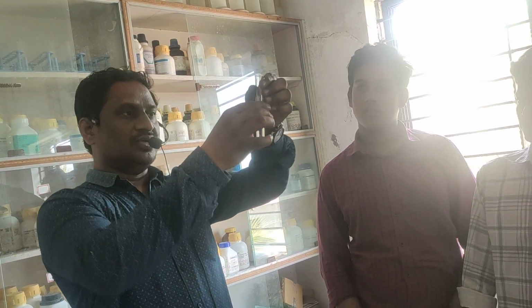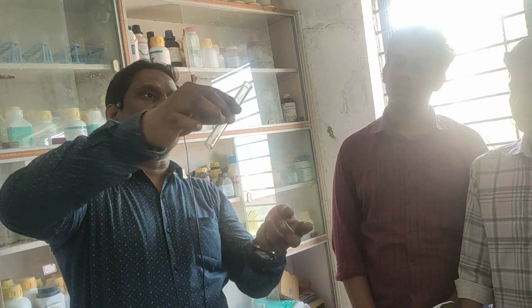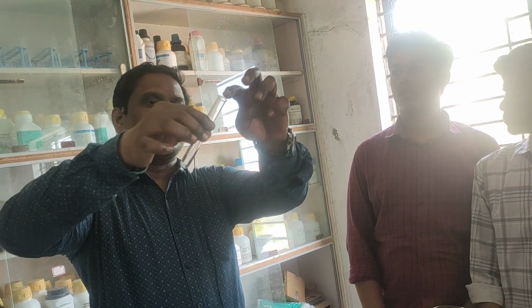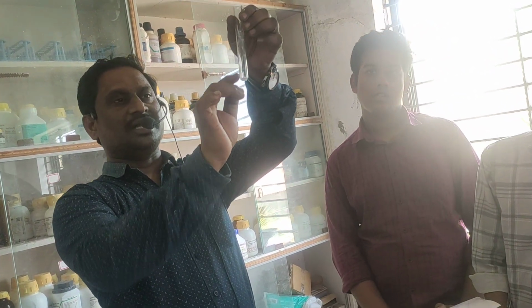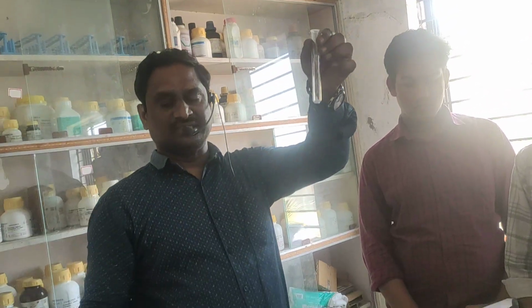When this gas is evolved and you pass it through lime water, it turns the water milky. We don't have lime water here, so we are not going to show that, but we will show the colorless gas along with the effervescence. So carbonate is present.